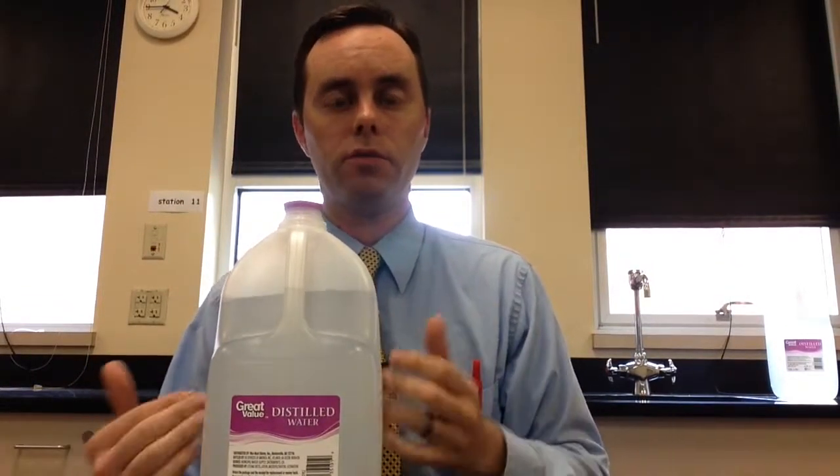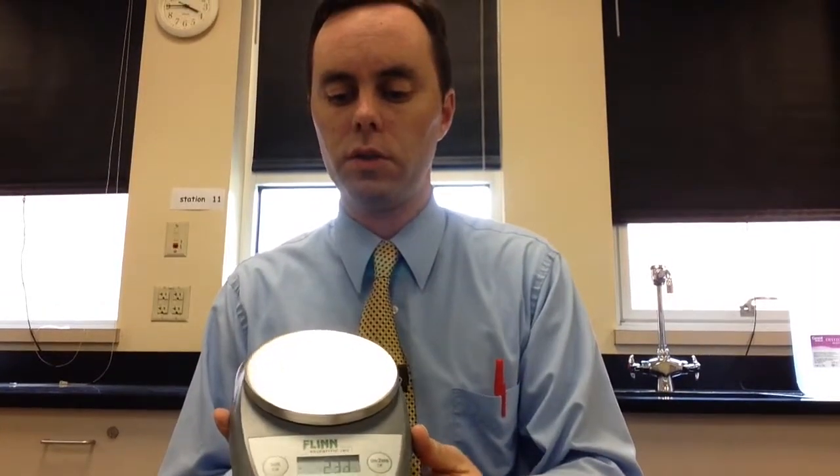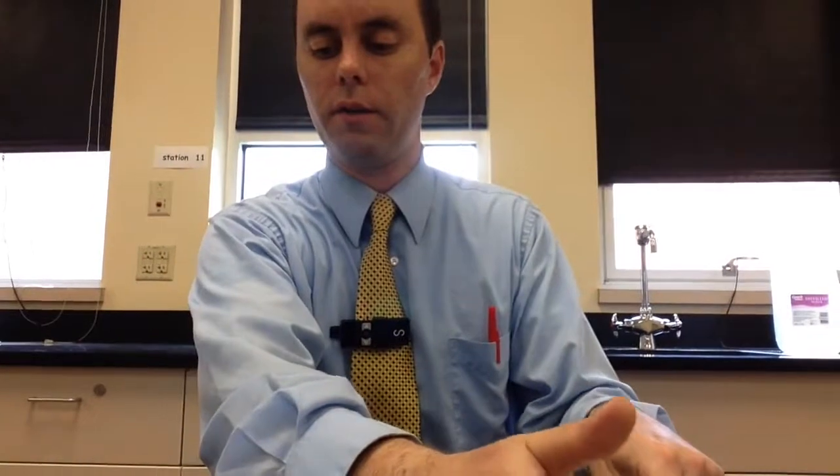So in order to do this, you're going to need some materials. Every group is going to need two of these. These are the glass beakers that we'll use. You're going to need a weigh boat like this thing. They should be located at the stations there for you. There are two plastic containers of distilled water. It's important that you use these and not water out of the tap because you will get false positives if you use water out of the tap. This stuff is pure water and has no contamination in it, so it's important you use these. And you're going to be using this digital scale that's here. So these are the primary components of what you're going to be using today, in addition to a conductivity probe and some hot plates, which I'll explain as we go through.